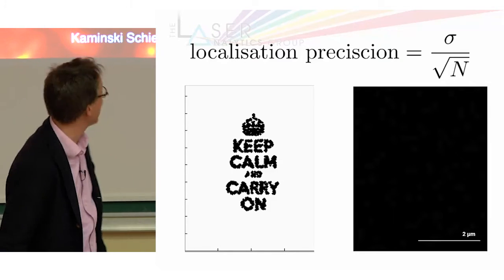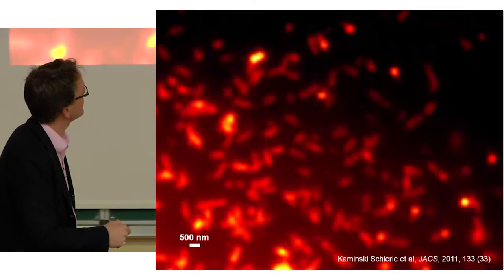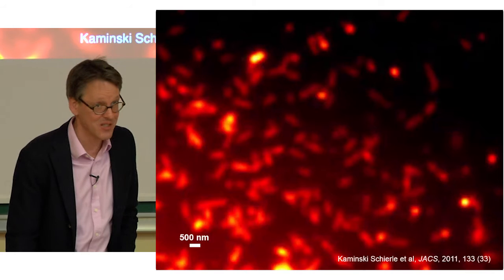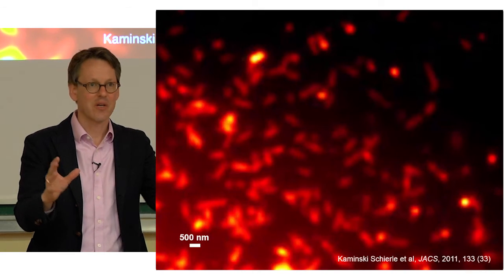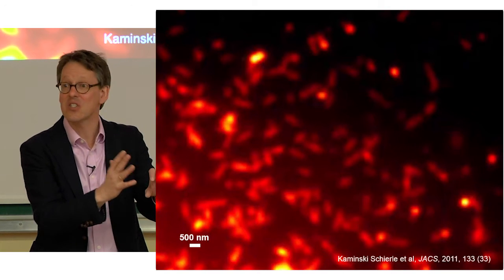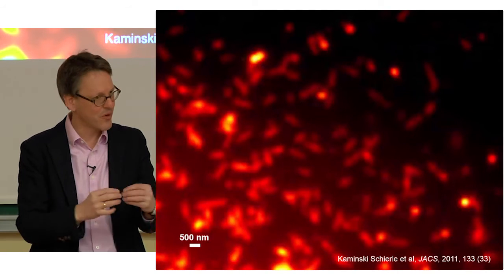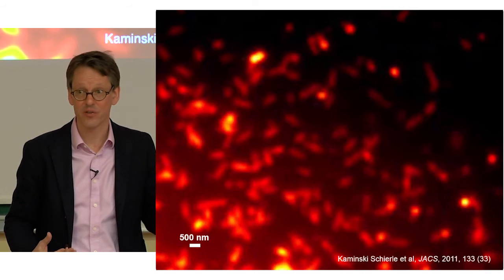And what that does in practice is shown here. Here's an image that we've taken of a protein called amyloid beta. Amyloid beta causes Alzheimer's disease. It's a protein that misfolds, so it doesn't adopt the correct shape, and then it starts getting sticky, and the protein will start to self-associate into long fibrils, and in the process becomes toxic and causes neuronal degeneration, so neurons start dying.